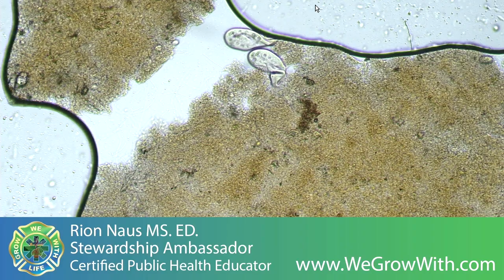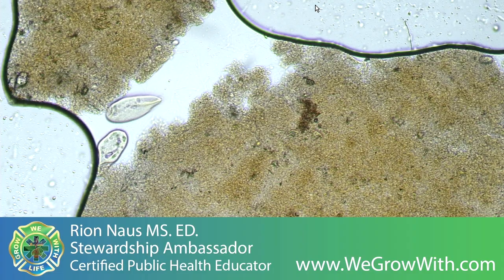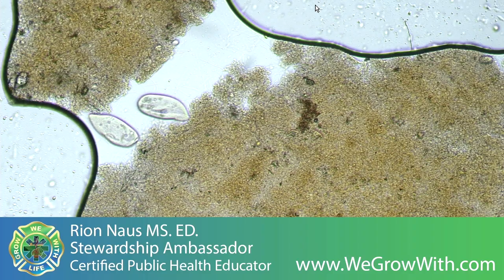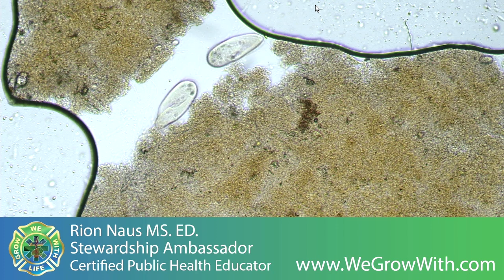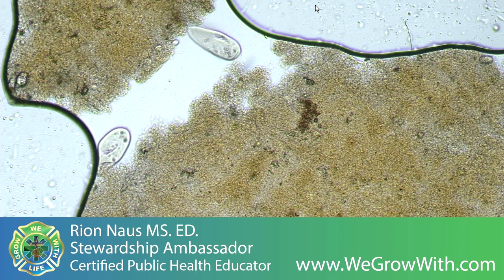This is at 100 magnification. You can see all the other material has already been squished together as the slide has dried, and the larger creatures enjoying a little freedom of movement while it lasts. Oh, kind of looks like they're working together now. Oh, they did. Look at that.